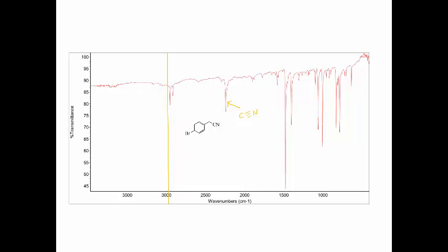And as you can see, sometimes this is deceptive. So here we have sp3 carbon hydrogen, but not really able to tell. Do we have sp2 carbon hydrogen? So sometimes it's not as easy to tell. It certainly looks like there's something going on there, but it's very small. And so for a compound like this, you would need verification, so you would take an NMR and see what the NMR looks like and use the IR in conjunction with the NMR.